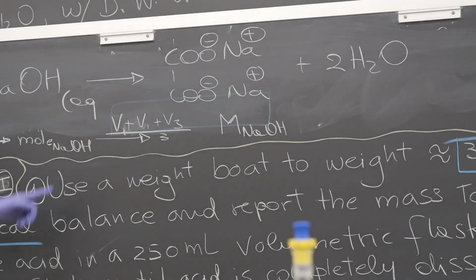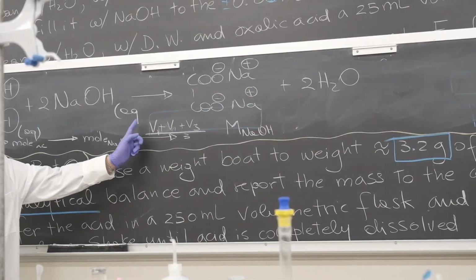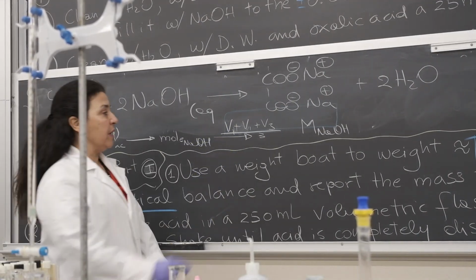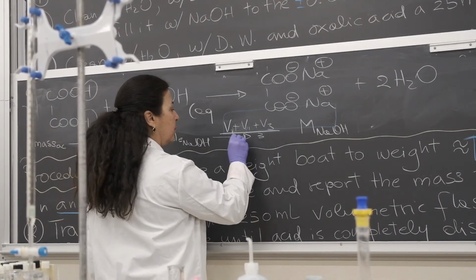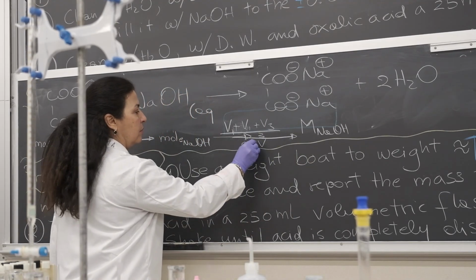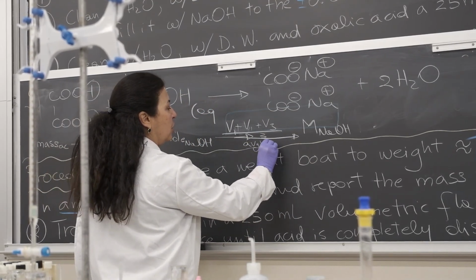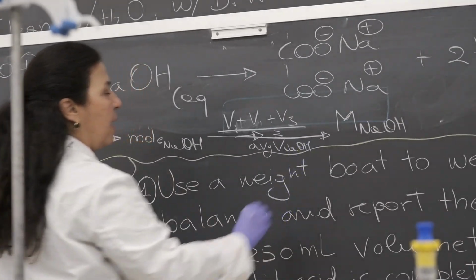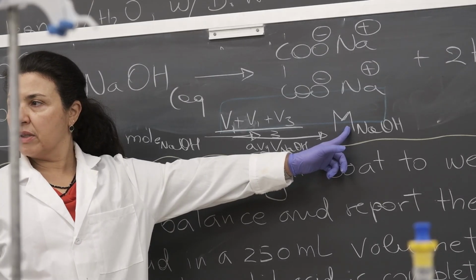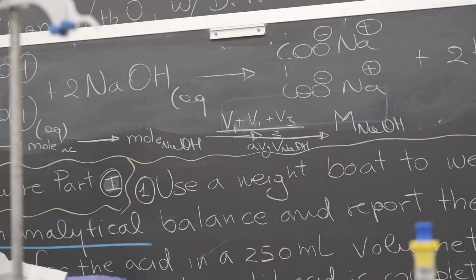Okay? So we are performing three very precise titrations. We figure out the average volume of the sodium hydroxide, and then we determine the average molarity of the sodium hydroxide. Okay?